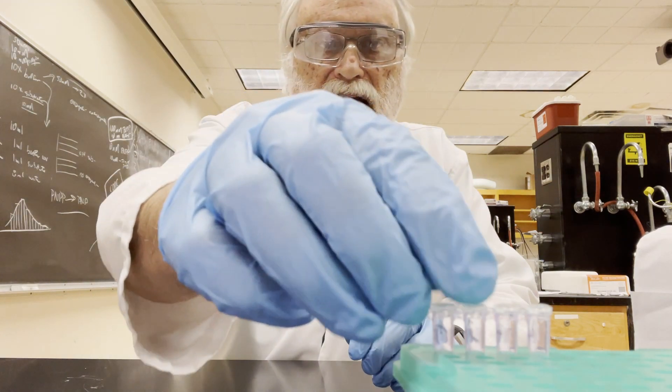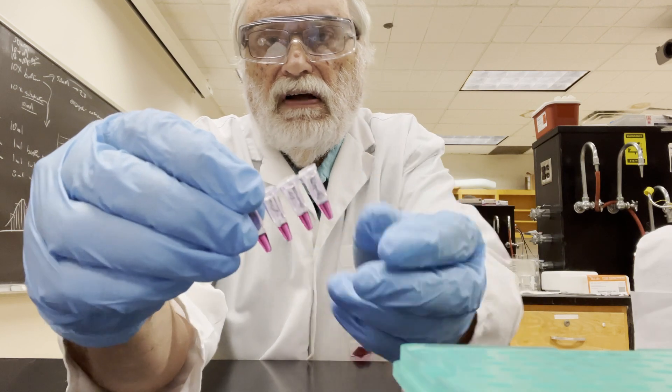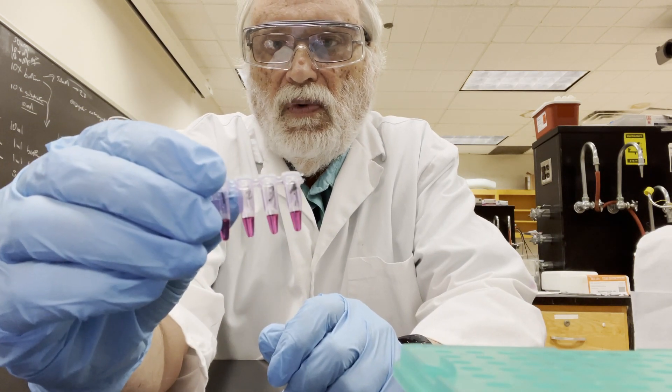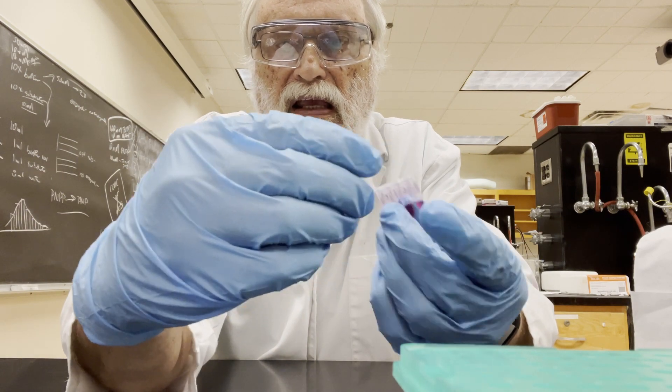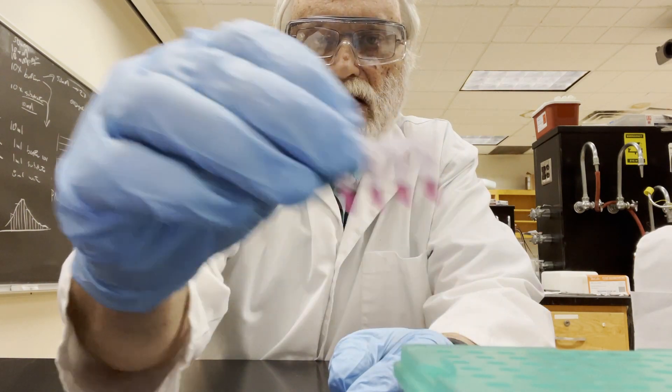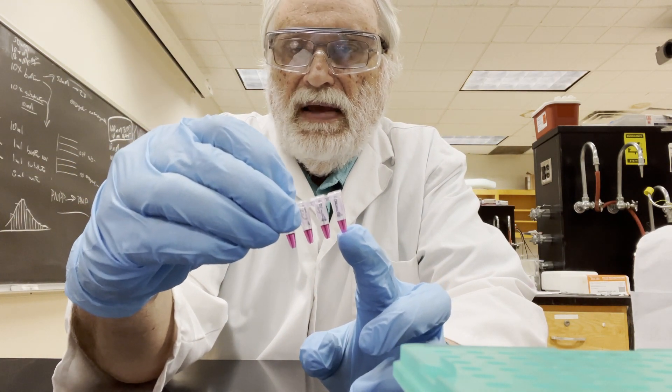So the first thing to do is, I've already done this step for you. You see these tubes here. I don't know if you can tell, I've already labeled them 1 through 4.